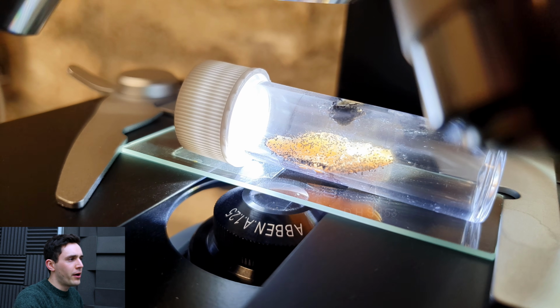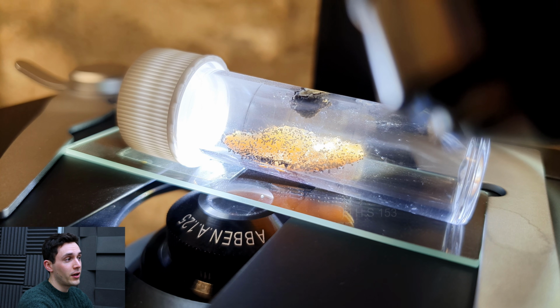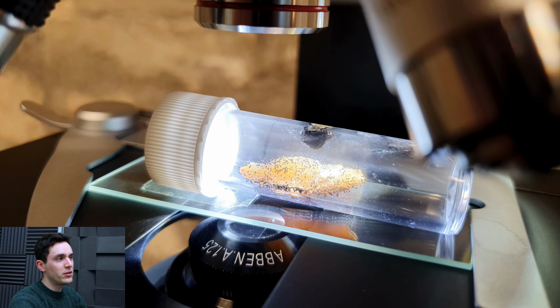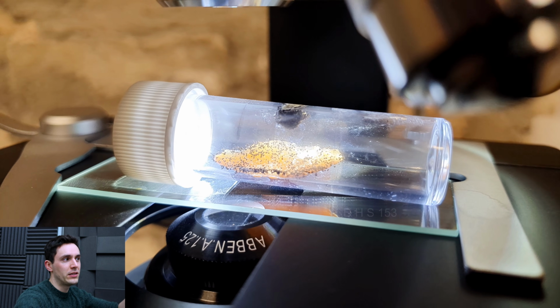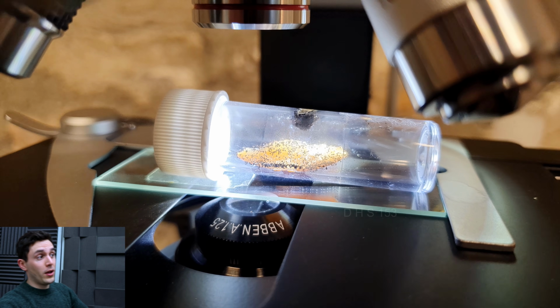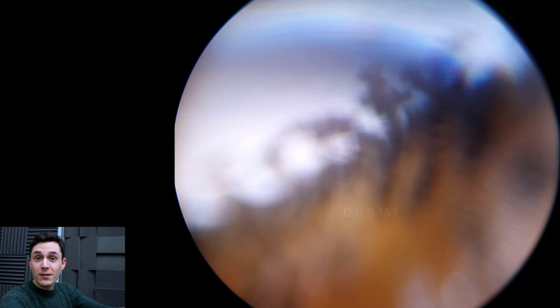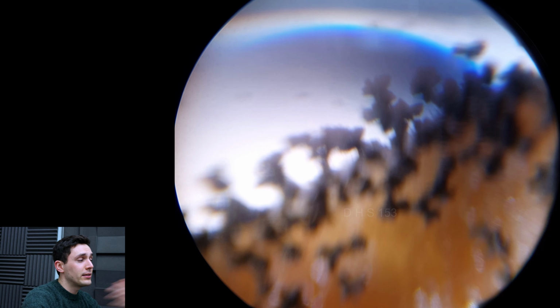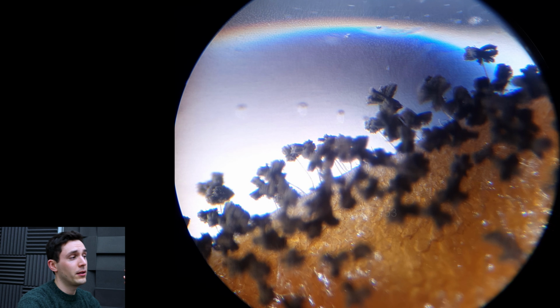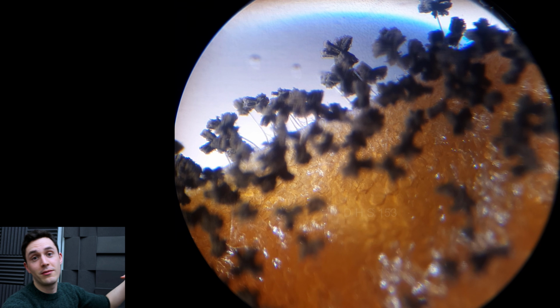In the initial stages of growth, I uploaded a video on it and it was Aspergillus niger, and you could see all the spores sprouting out of this piece of infected earwax. Since then, people have been asking me for an update, and here is the update. I did feed it a piece of apple, and here it is. The Aspergillus niger fungus has grown from that piece of infected earwax and nicely spread across the apple.